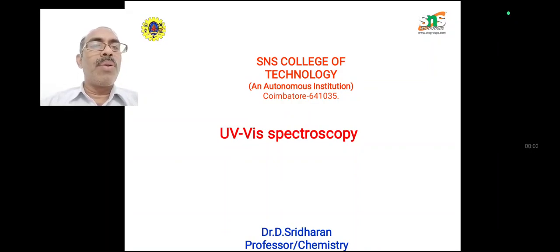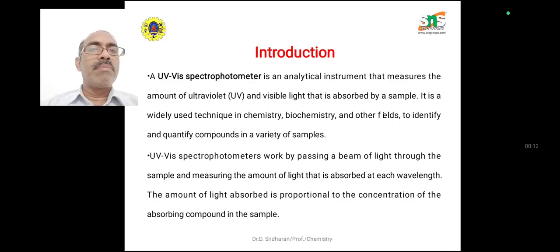In this video, we are going to see about UV visible spectroscopy for the analysis of organic and inorganic chemical samples. Introduction to UV visible spectroscopy.